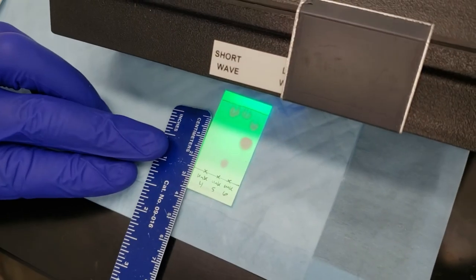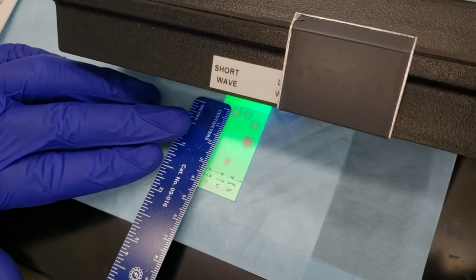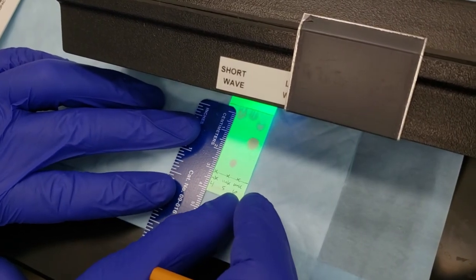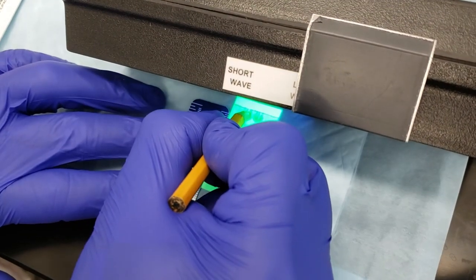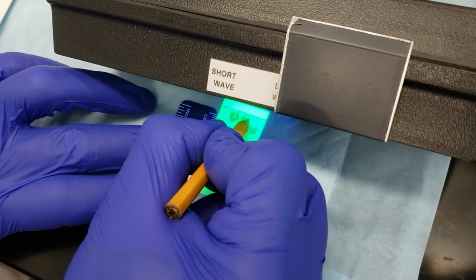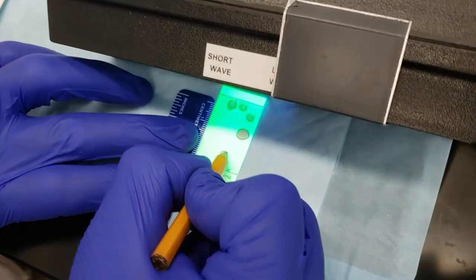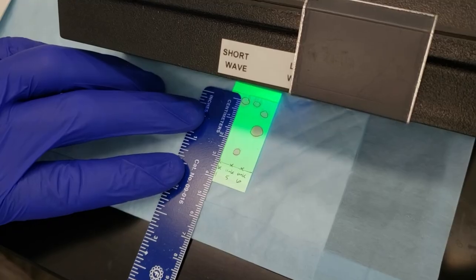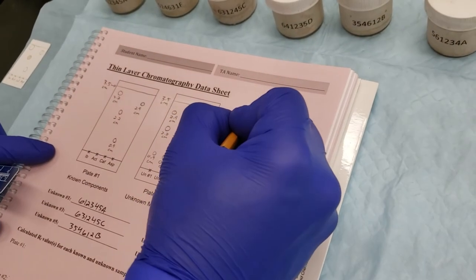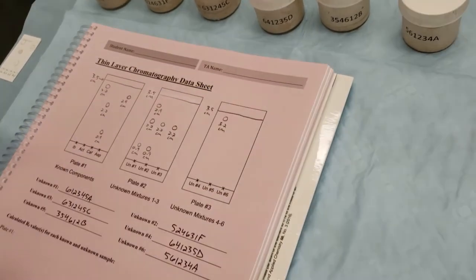For unknown number four, we see only one spot, and that's up very close to the top here. If I measure from the midline, I'm going to go ahead and circle in the midpoint of these spots, so that I can visualize them after the light has been turned off. But if I look at the midpoint, I'm at 3.2. So for unknown number four, we've got a single spot at 3.2 centimeters.